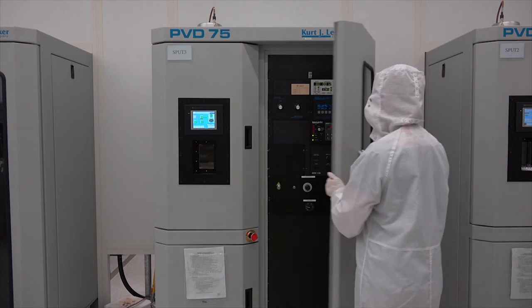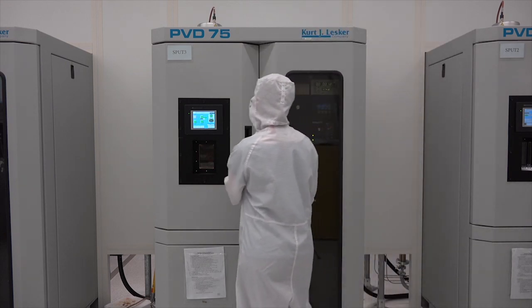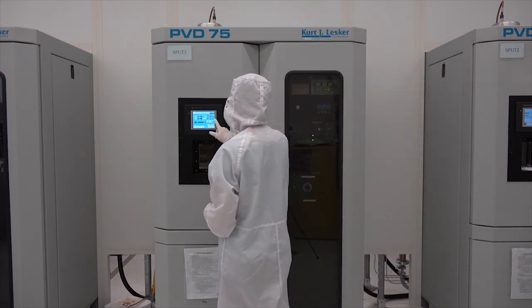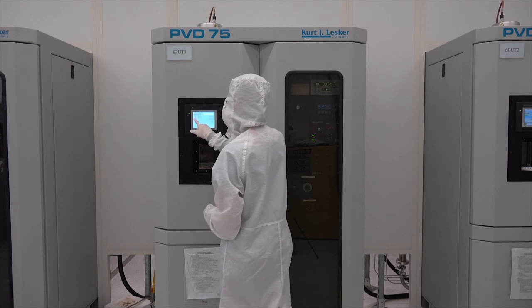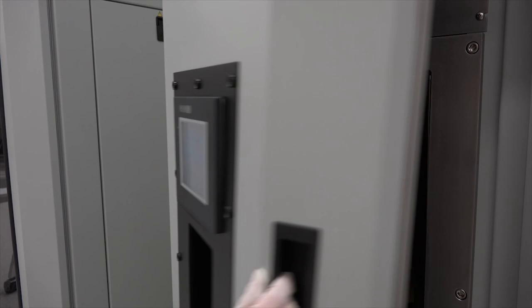With the plasma off, we turn off the argon gas flow and set the turbo pump speed back to normal, which is 100%. We are now ready to retrieve our sample. To do this, we vent the chamber just like at the start of the video. With the chamber now vented, we can open the door and take out our sample.